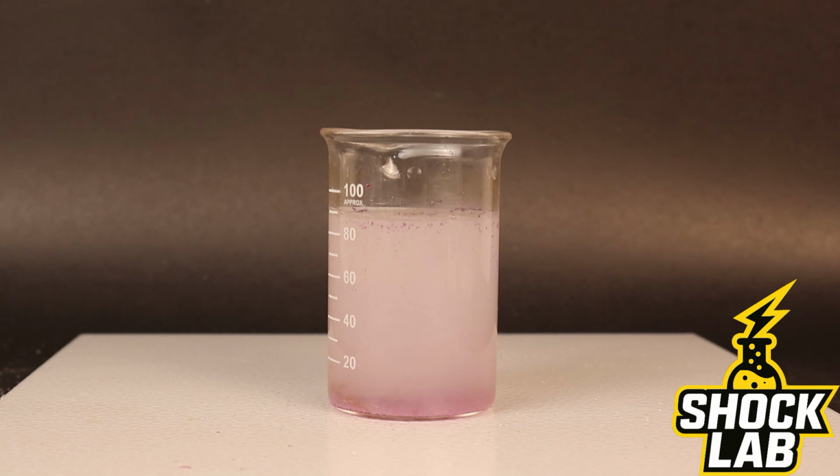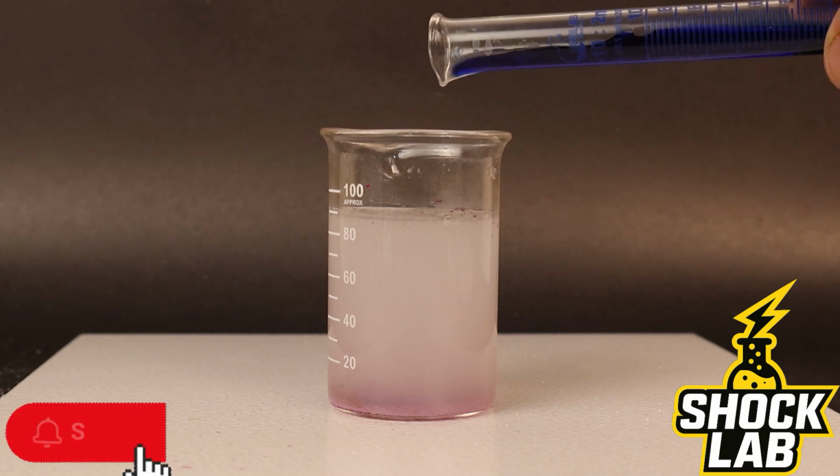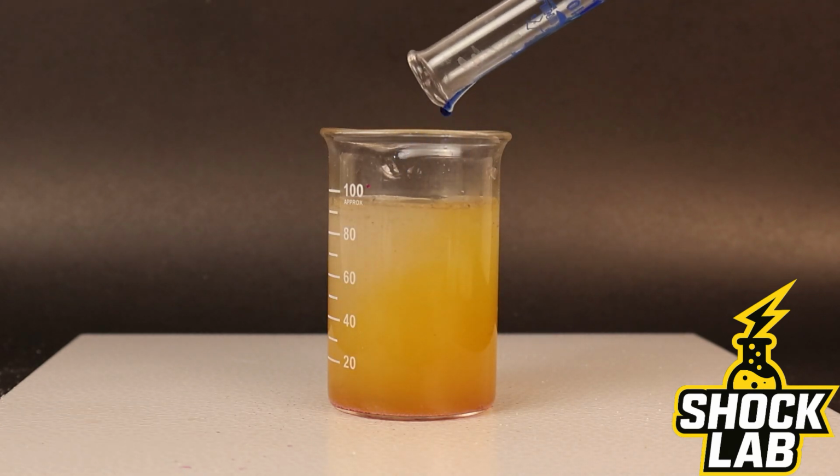Now for the final step. I add a few drops of bromothymol blue. This indicator responds differently to changes in pH. Since the solution has become acidic, it immediately turns bright yellow.